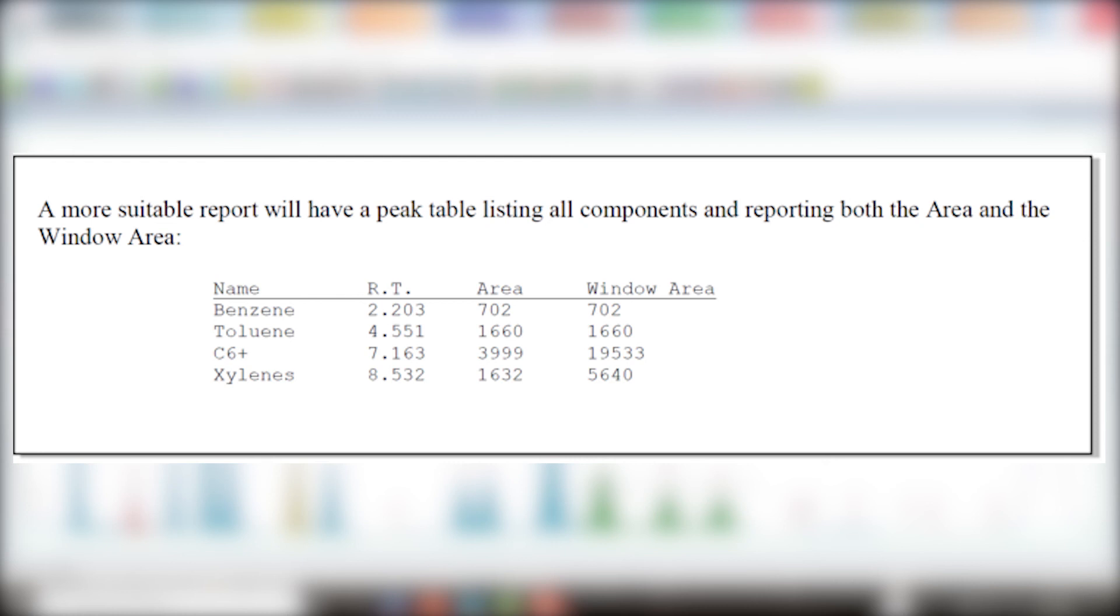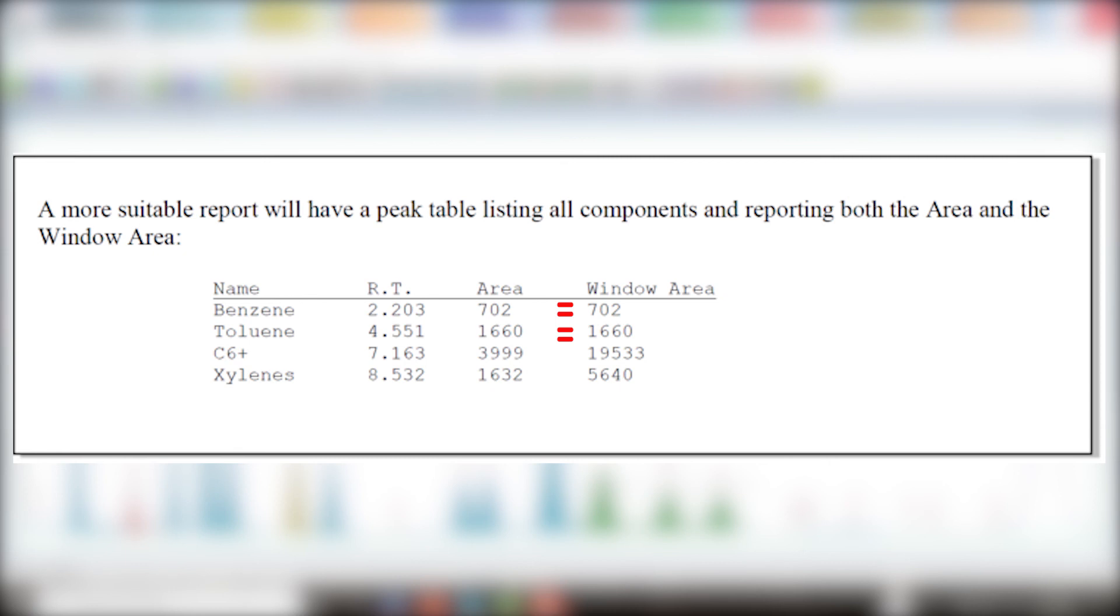A custom report must be defined for this purpose. For the first two components, benzene and toluene, the area and the window area are identical to one another and to the peak areas shown in the previous table. This is expected behavior for all nested single-peak search windows, where only one peak is involved.